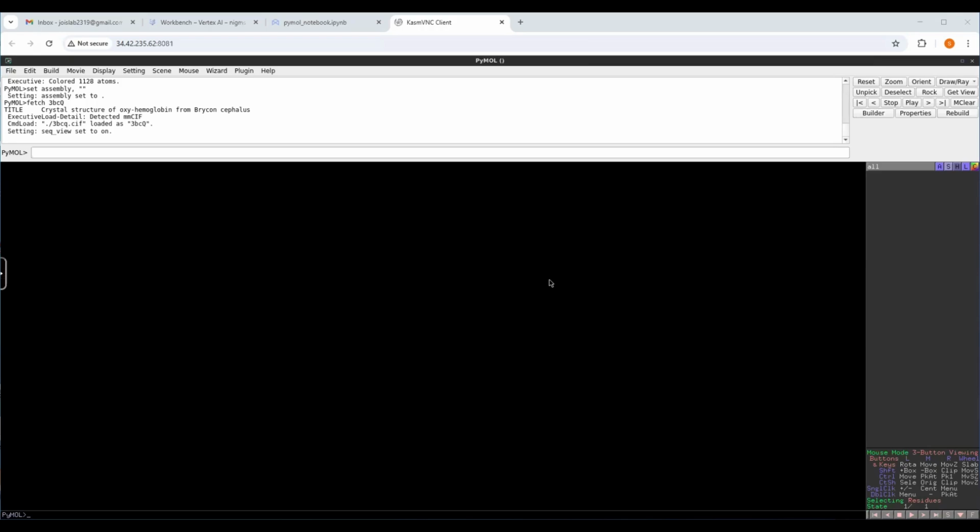Hi, in this video, I'm going to show the example of hydrogen bonding and hydrophobic interaction. I will use hemoglobin to visualize the hydrophobic and hydrogen bonding interactions. We'll also see the interaction between porphyrin and the protein.